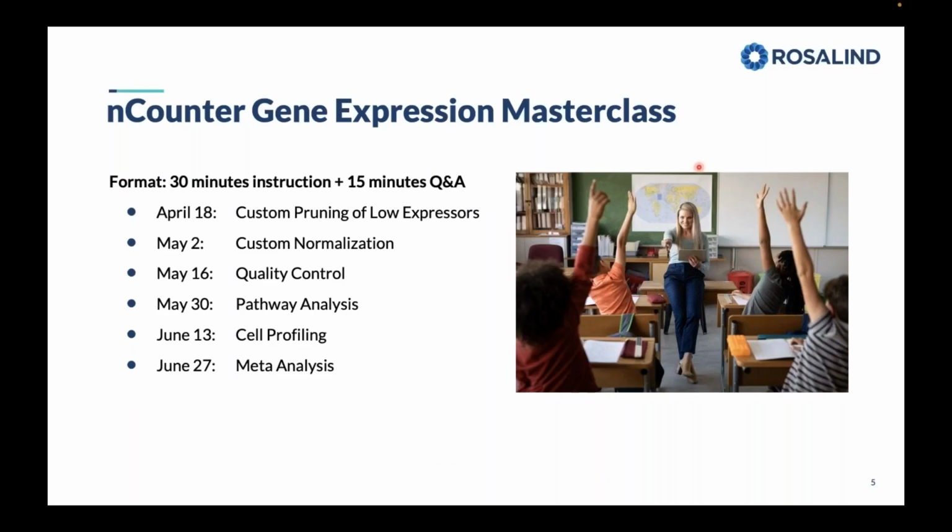Our next session is May 2nd, and we're going into customized normalization. So I'll explain the details of how normalization works, different approaches, different strategies, and it'll be very similar to the session we just did.